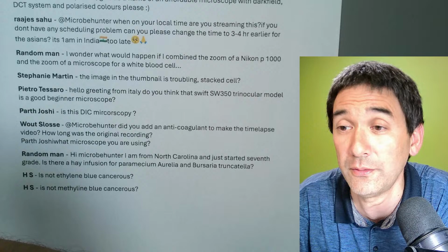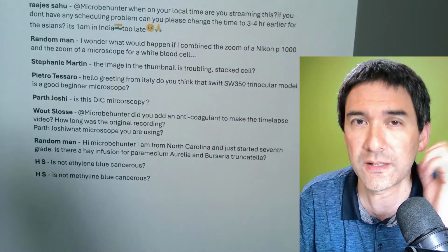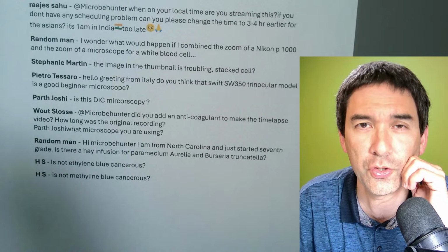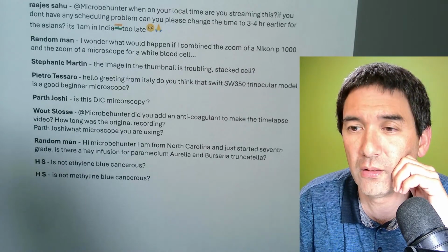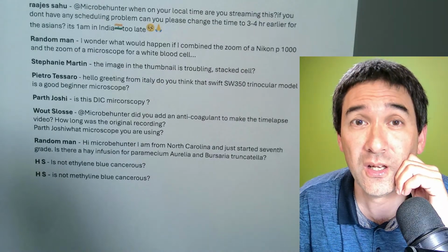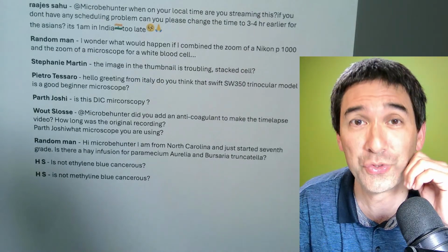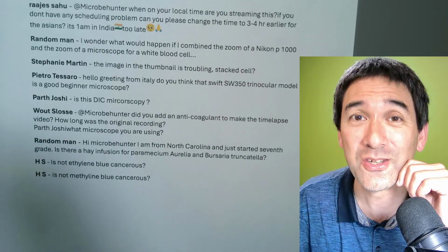I tell you, the first time I looked at it today was the last time. First time I think a couple of years ago when I started to make those microscopy videos. I see a difference all the time, because the thing that causes the blood to appear most different is the amount of blood that they use, the thickness of the blood.